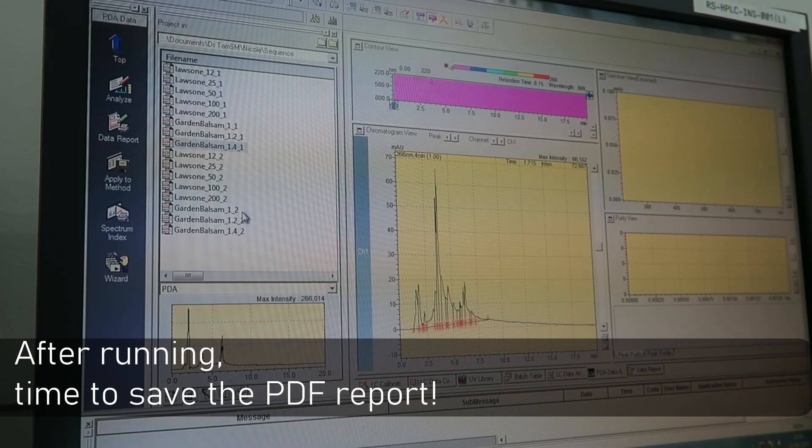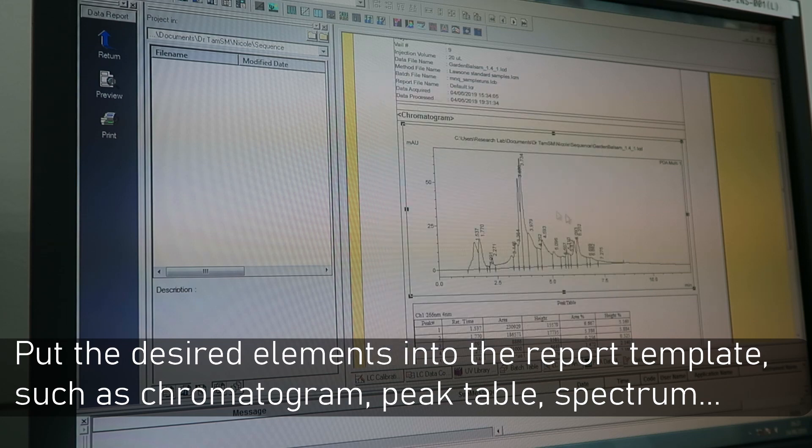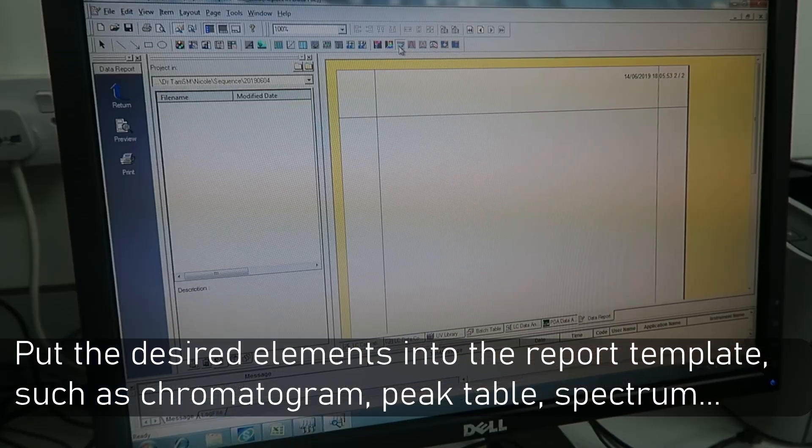After running, it's time to save the PDF file. Go to the data report at the left sidebar. Put the desired elements into the report, such as the chromatogram, peak table, and spectrum.